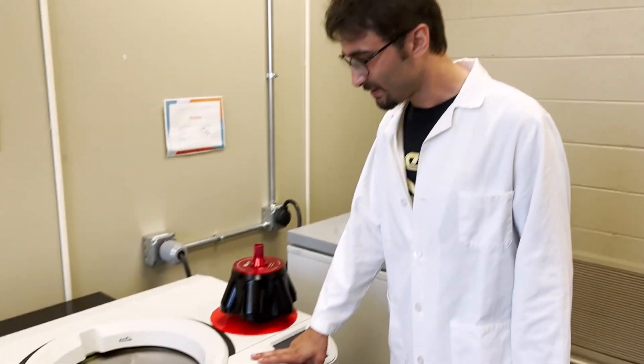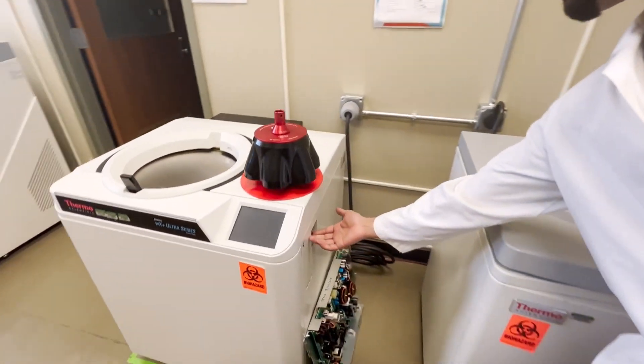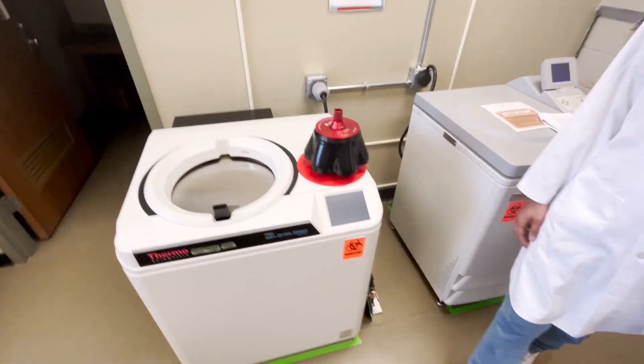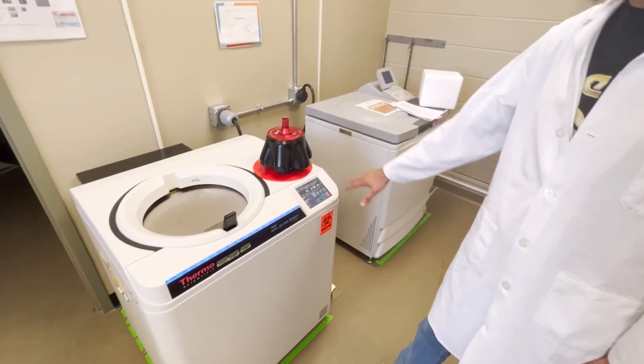This is the ultracentrifuge. There is a start button here — we just push it. You can see that it turns blue, which means it's almost ready for you to put in your settings.